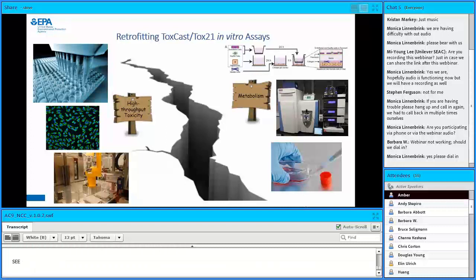The focus is on using biologically complex but biologically relevant cell systems, a lot more complicated than what we use in high-throughput toxicity testing. They involve feeder layers of cells or matrigel sandwiches and things that aren't really amenable to high-throughput testing. A lot of the ways you measure metabolism in this world are low throughput, using liquid chromatography coupled with tandem mass spectrometry. A lot of times these are looking a little more mechanistically, at how a particular parent is metabolized and what metabolites form, and getting ideas of measuring the rates and things like that.